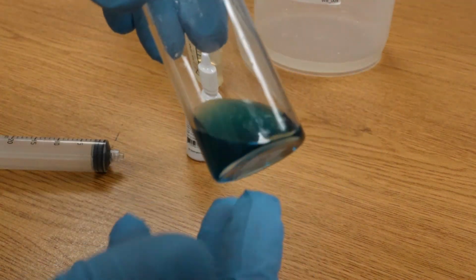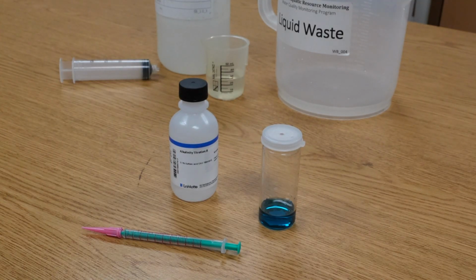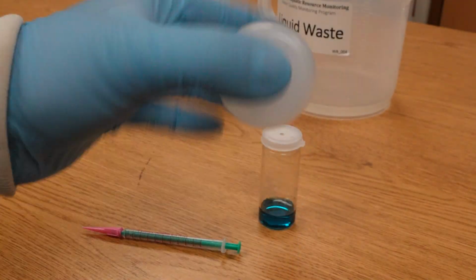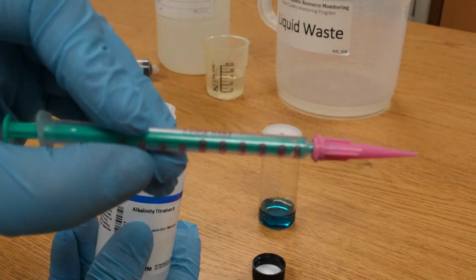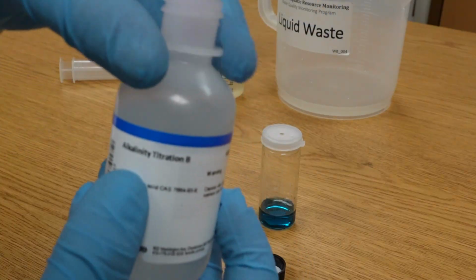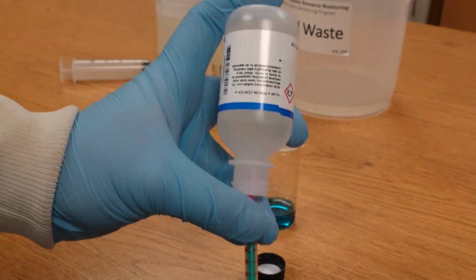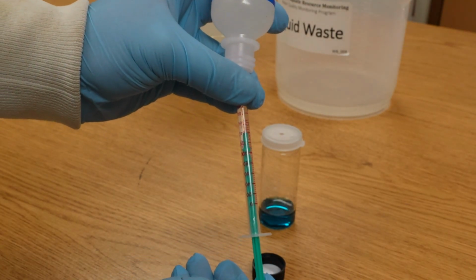Now that the indicator has been added to the sample water, it is time to fill the titrator syringe. First, invert reagent B 3 times. Please be careful, reagent B is an acid, so make sure you take precautions when handling it. Then, insert the titrator syringe into the reagent B cap. Hold the bottle in one hand and the titrator in the other. Invert the bottle. Draw reagent B into the titrator syringe by slowly pulling the plunger to 0 on the titrator.